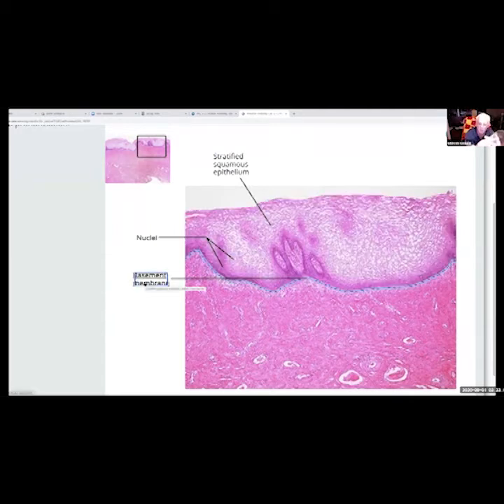You look at the apical portion, you see the cells are just really flat and squished down as they've moved upwards. So it's stratified, definitely more than one layer. Squamous, because all the cells are squished near the top there, and epithelium.